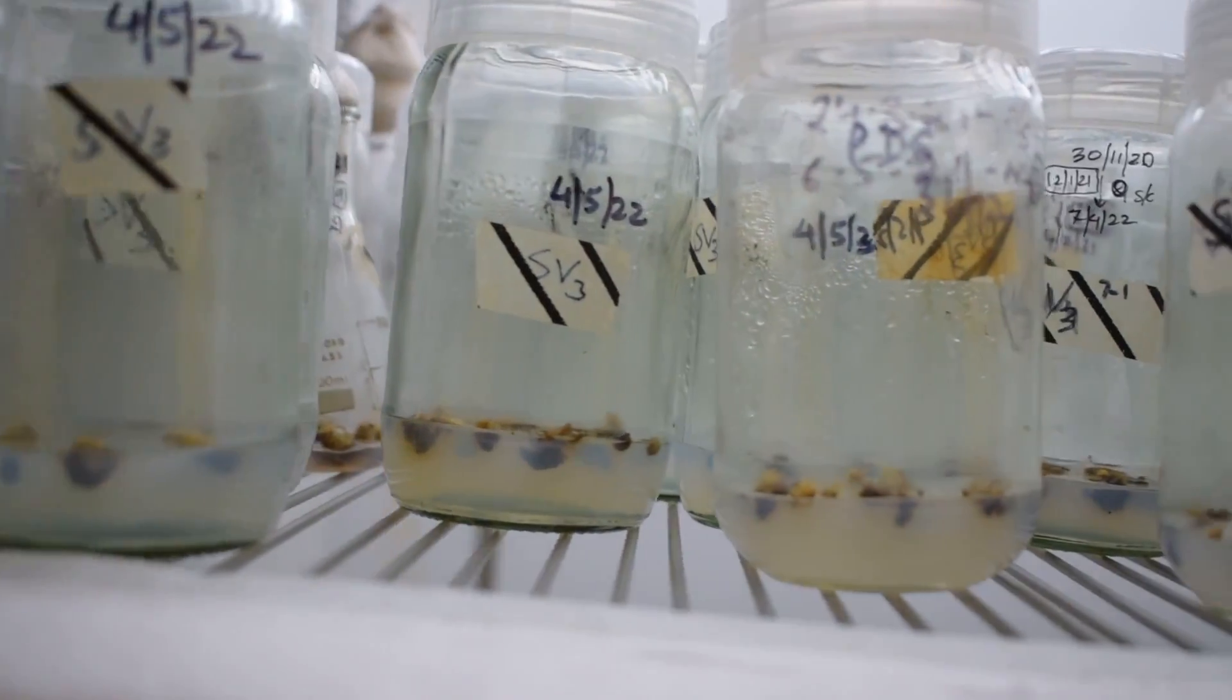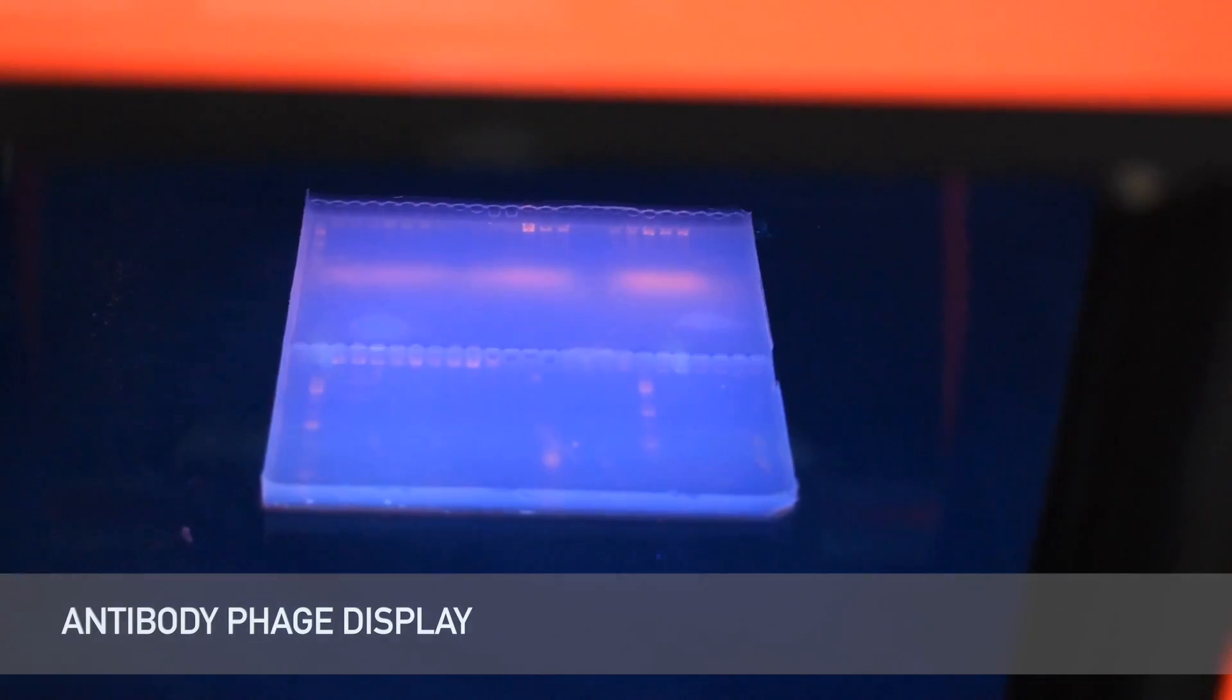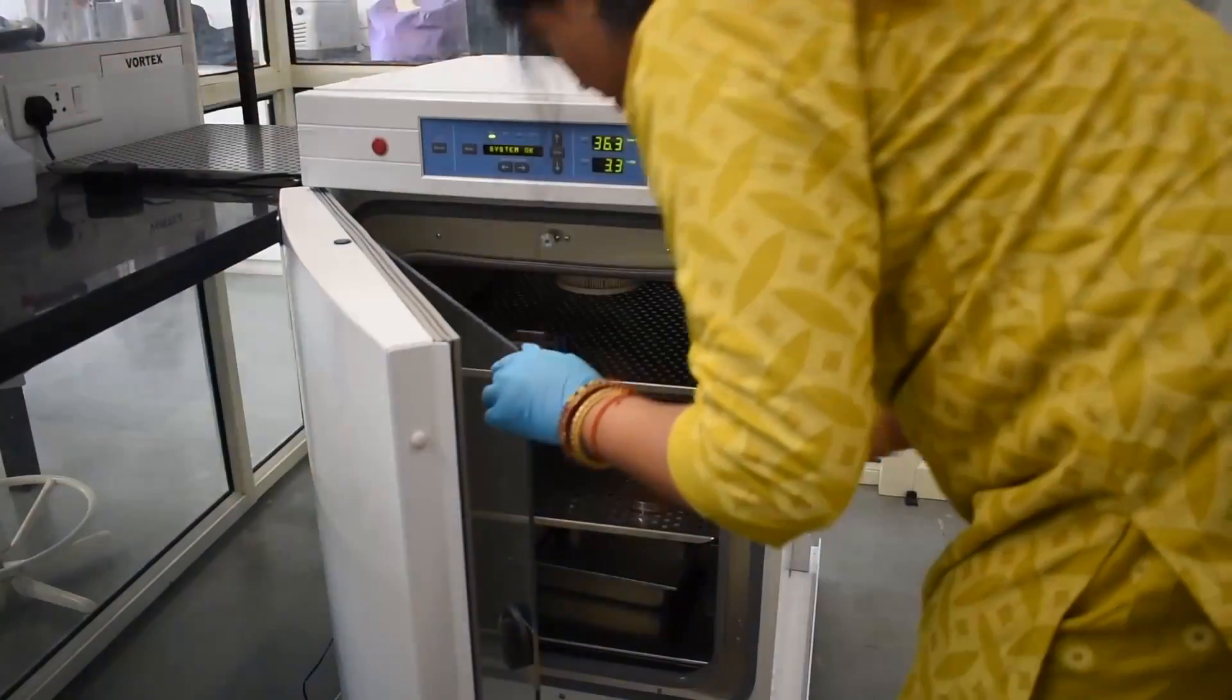We focus on training our students for studying microbes, immunological techniques and antibody phage display, and excelling them as good professionals to be industry ready.